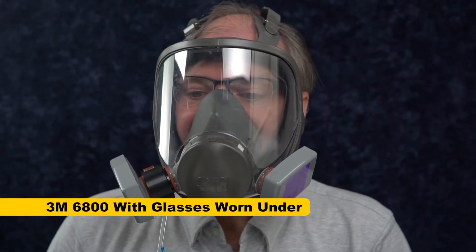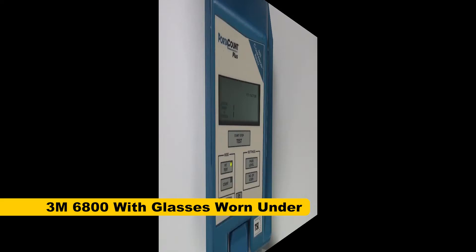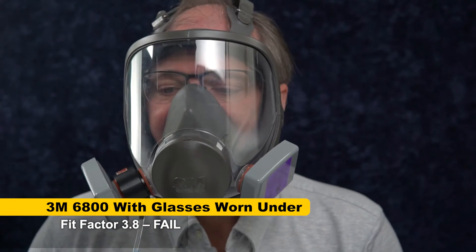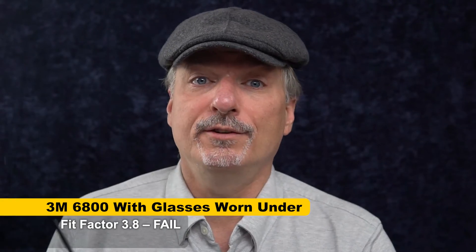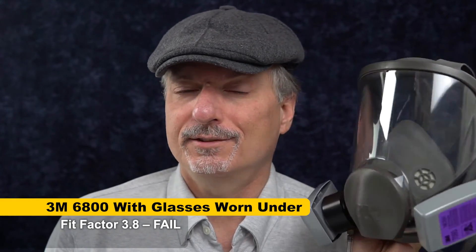So now let's try it with these big chunky framed glasses and see how much that compromises the seal. I would say don't do this even without doing the fit test, but let's see what the fit test has to say. The result: 3.8 — that is absolutely terrible. With the chunky glasses and the full face mask, we got a terrible score of 3.8. That's surgical mask territory. There's no point in wearing a $150 mask with P100 filters if you're just going to get crappy scores like that — it's not protecting you at all. Don't even bother.